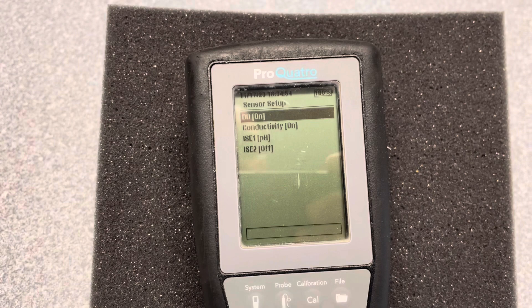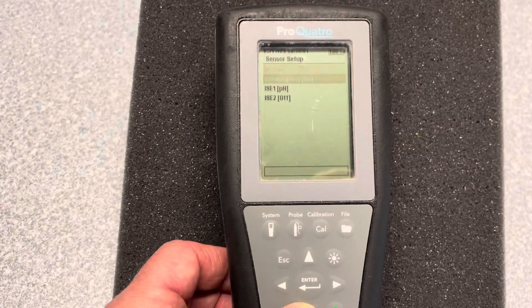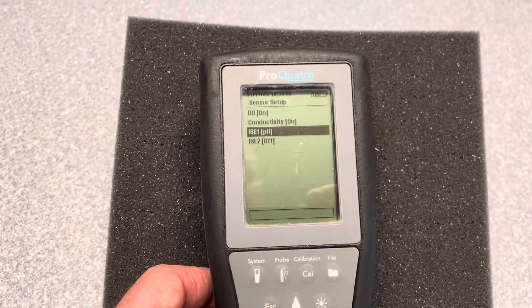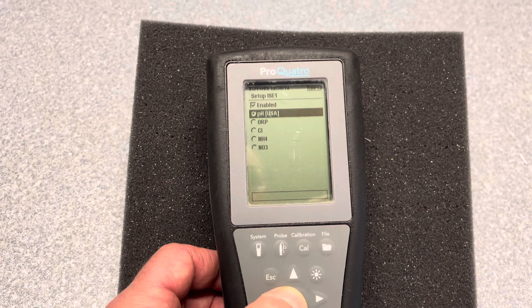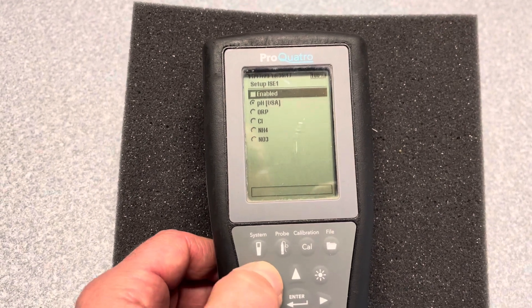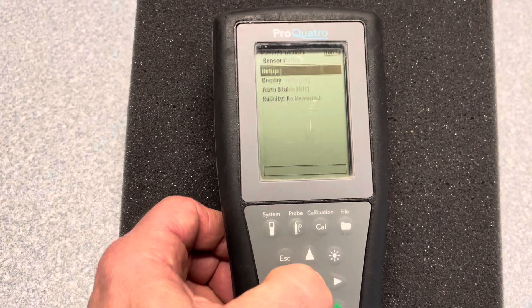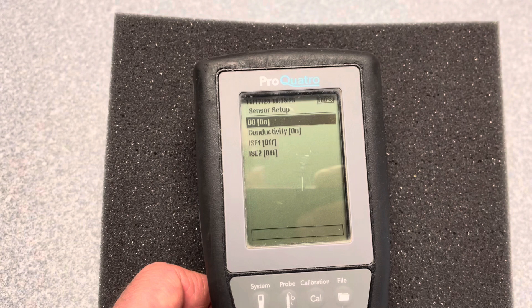PH is on, and ISE2 is turned off. You can just scroll up or down. We're going to turn off PH in this example. I'm highlighting it and I'm going to press Enter. We're going to go up and deselect the checkbox. When we go back to the Probe and Setup, we're going to see that PH is turned off.